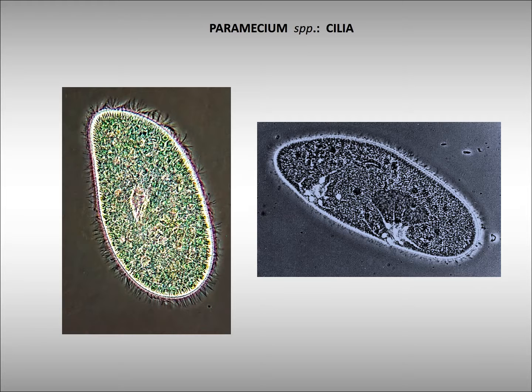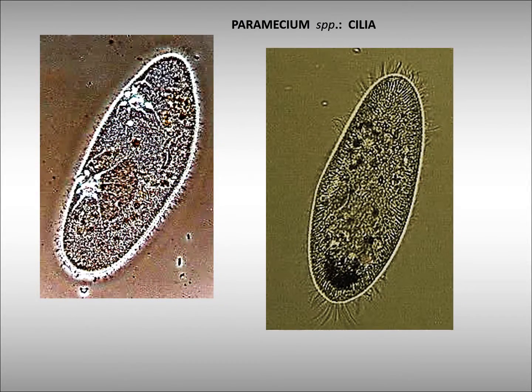The cilia vary in appearance with respect to their length, coarseness, or thickness, dependent in part upon the type of illumination utilized. For example, reflected interference, differential interference, Nomarski interference, or ordinary incandescent light with various filters, such as a daylight filter.